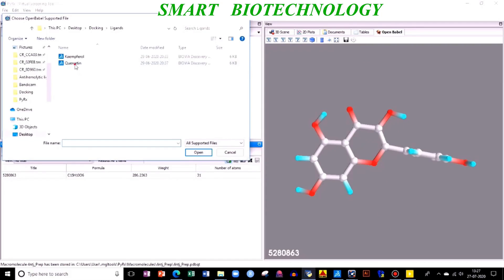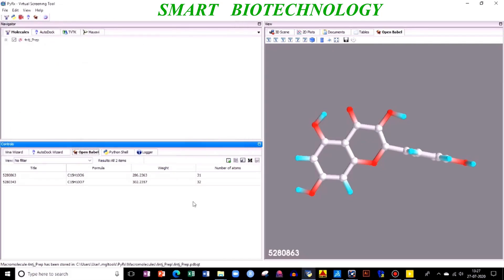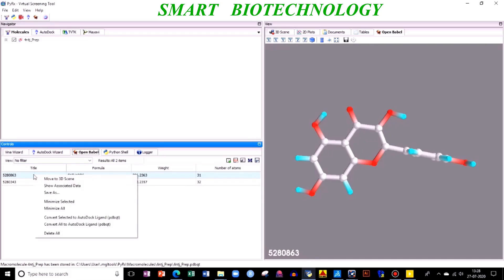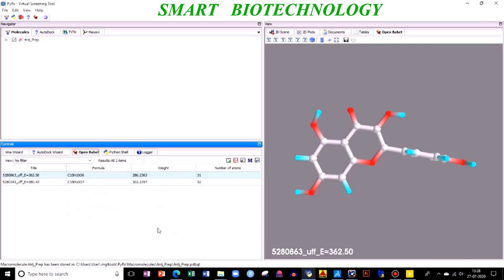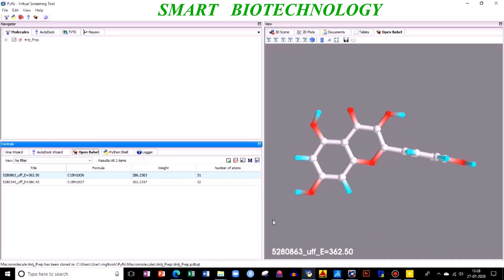You can dock individually your ligand with your protein, or multiple ligands with your target. Next, this is very important - this is your formula, this is your title number. Right-click, then you need to do minimize all. What does it mean? Minimize all means you are minimizing the energy of your docking ligand with your protein. This is your E=362.50 in kilojoule per mole.